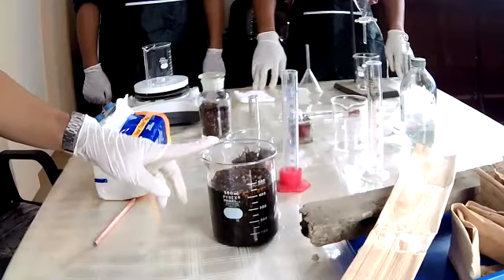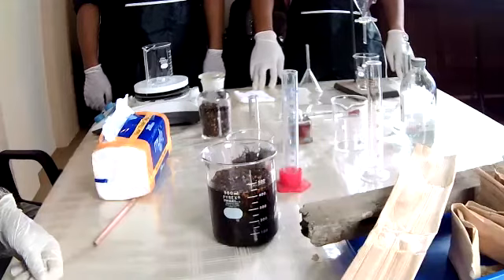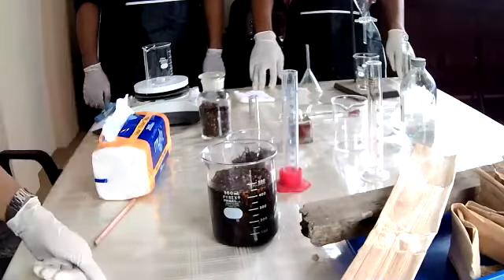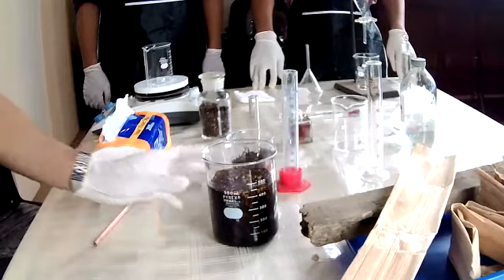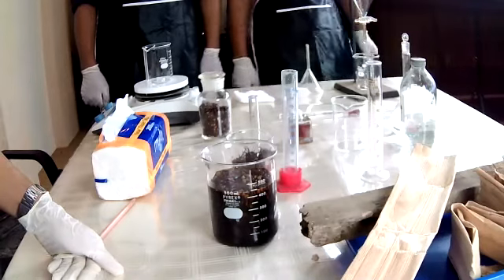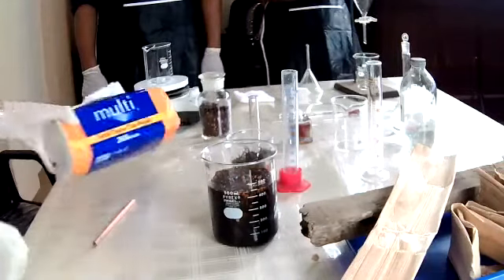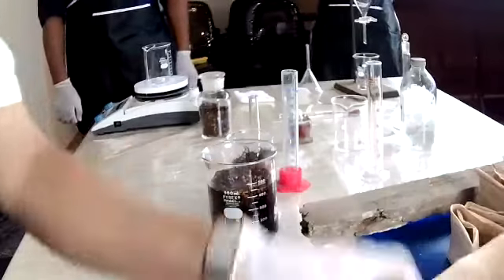So we soak this or we ferment this for 24 hours. And we can also heat this on a stove. But if you want to mimic the traditional way of this solution, then we use this cold process or the fermentation process using the cold process without any heat involved or high temperature involved.